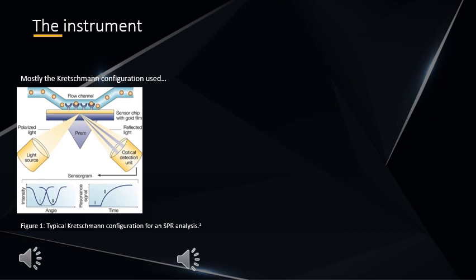The reflected light is then fed into a detector which measures the intensity over some experimental value like time or progressive addition of analyte, and this change in intensity directly reflects the change in a dielectric's refractive index. This is because a change in refractive index will change the resonance criteria between the incident light and the plasmons, giving us insight into binding events, effects of changes in concentrations, and so on, as these change the refractive index of the secondary medium. The detector is then connected to a sensorgram, which plots the data on a graph so it can be interpreted.